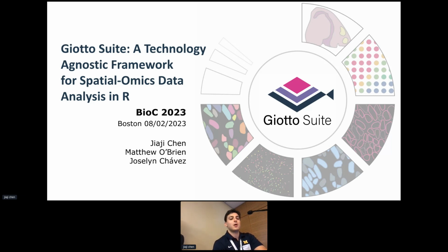The question right now is about utilization of an external segmentation method and integrating that with this idea of spatial locations, right? Merging your spot level resolution with, say, a Xenium experiment that is segmented, finding the nuclei, and merging that together to find out how many nuclei and what information you can glean from one given spot.